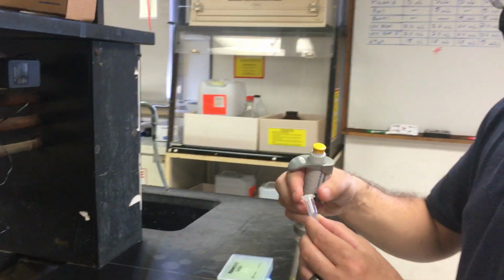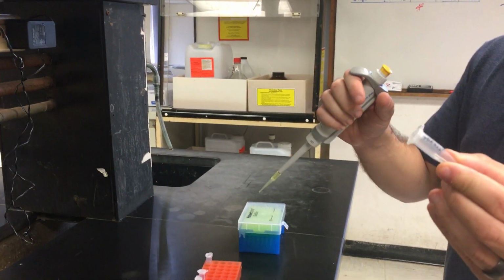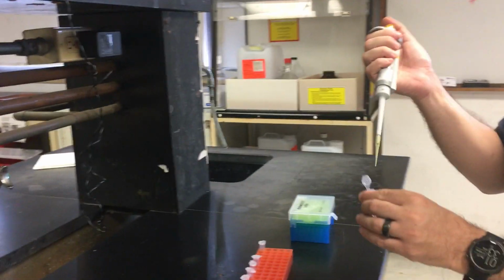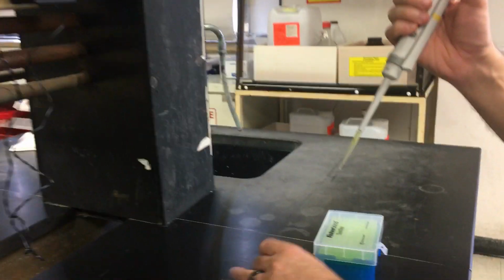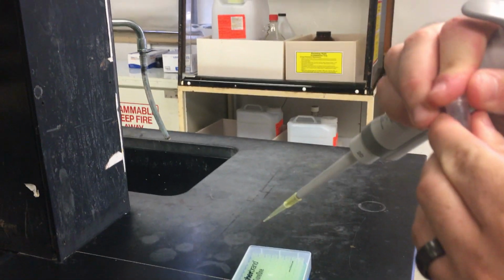Okay, so I'm going to be using the plasmid pBR322 instead of pUC19. So it's going to be here. We're going to be taking 5 microliters of our plasmid. Remember, you pick up the volume and then I'm going to be putting that into an empty tube for a reaction.